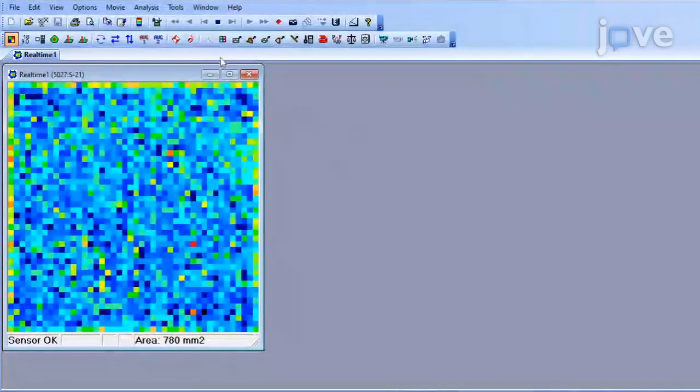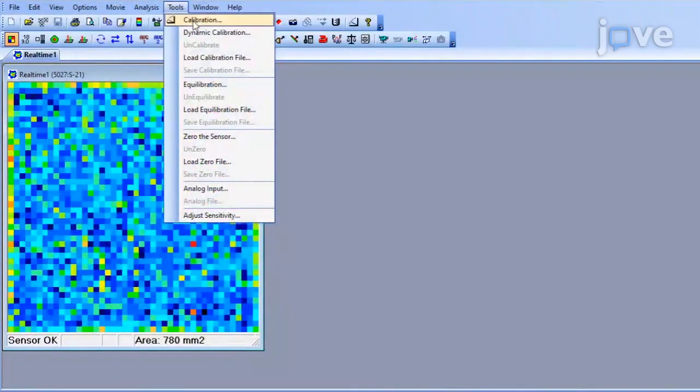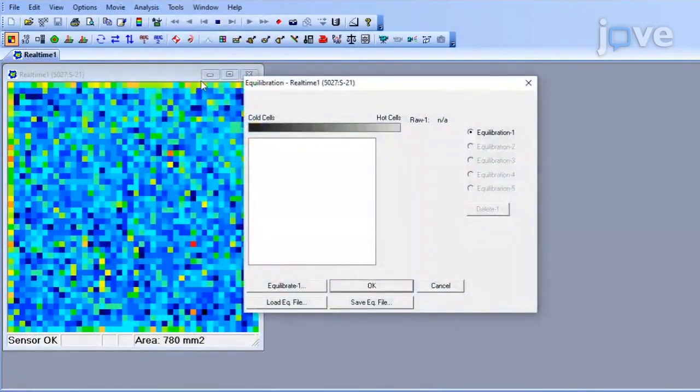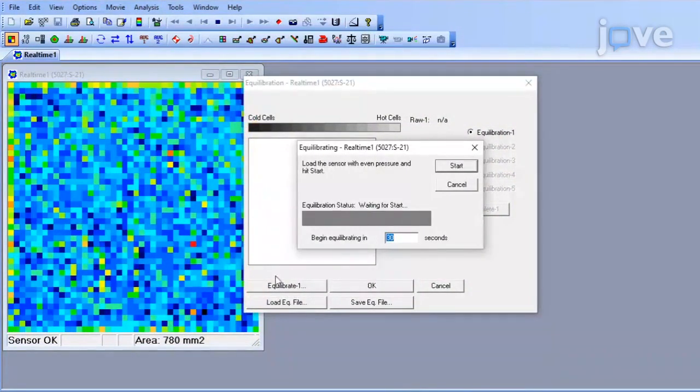While pressure is being applied, select Tools and Equilibration and click Equilibrate 1 and Start in the Equilibration dialog box. The color of Equilibration of the window should change to gray.